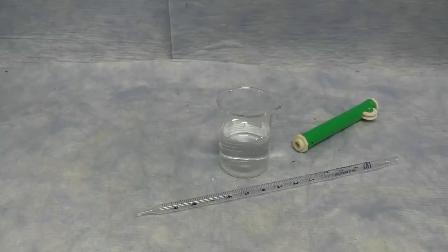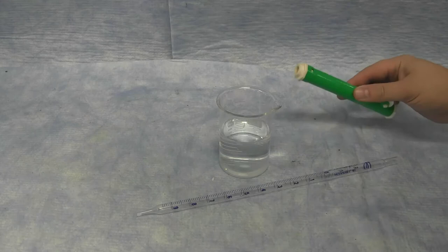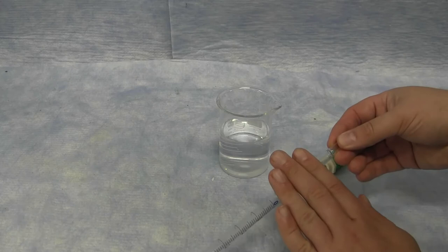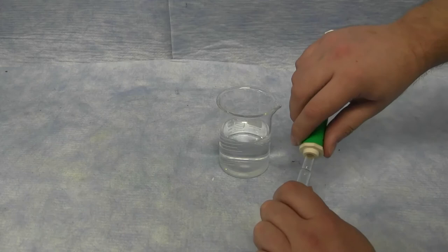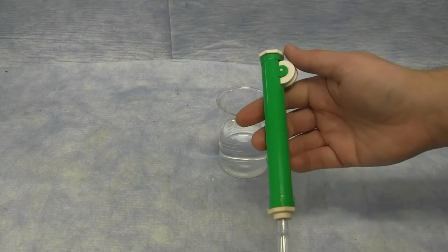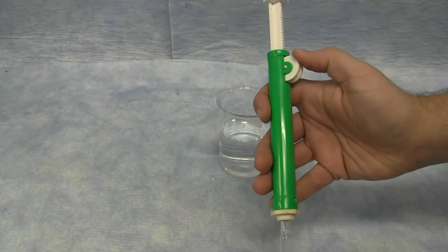To dispense volume from a pipette using a pipette pump, the pump itself is fixed to the end of the pipette. When doing so, please hold the pipette close to where you are placing the pump onto the pipette itself. This can be fixed where it is snugly fit on the pipette. Using the dial, you can draw liquid up into the pipette or dispense liquid from the pipette.